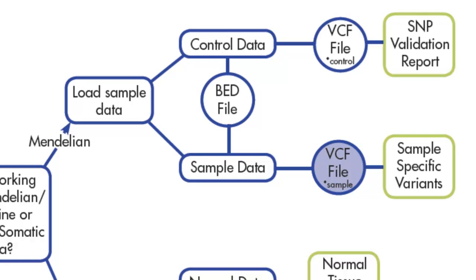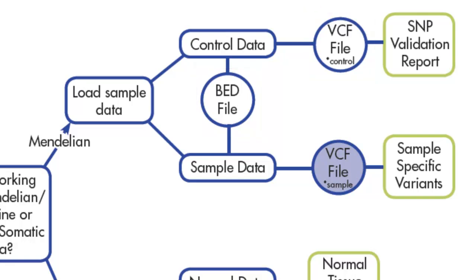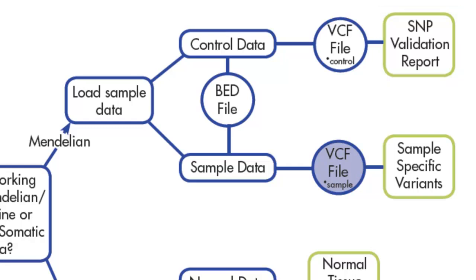By incorporating VCF and BED or manifest files into your workflow, you can ultimately validate the overall specificity, sensitivity, and accuracy of your assembly, and analyze these statistics in an ArrayStar report.